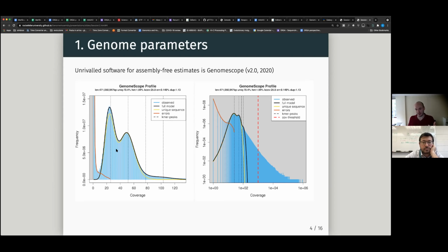It's actually very fast if you have tried. And when you get to the point that it's fit, you have estimated the relevant parameters of the distributions, and then you can make some very fancy computations. It's simple in a way, but the math becomes very complicated quite rapidly, because you have to estimate all potential combinations of alleles that could contribute to this peak or to this other peak.